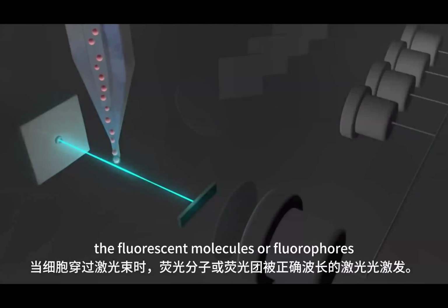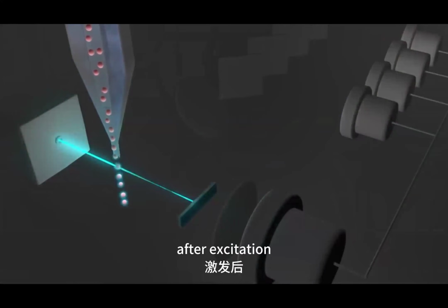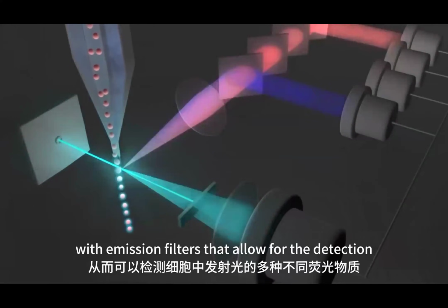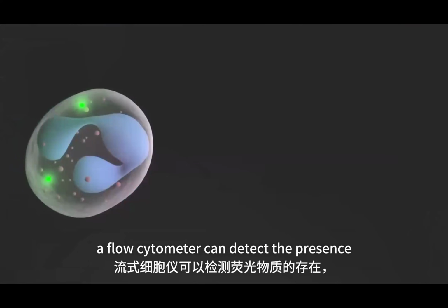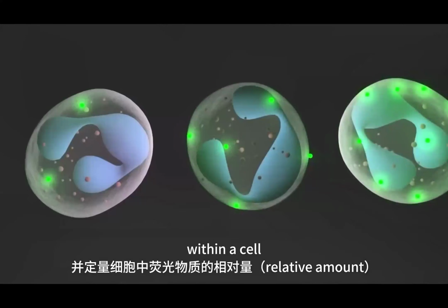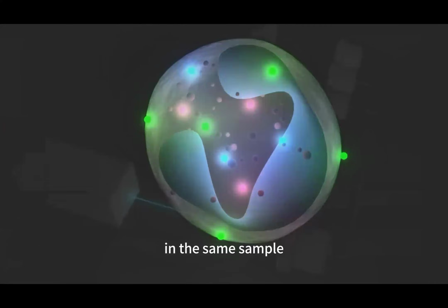The fluorescent molecules, or fluorophores, are excited by the correct wavelength of laser light when the cell passes through the laser beam. After excitation, the light emitted by the fluorophore is directed along a path with emission filters that allow for the detection of multiple different fluorophores emitting light in a cell. A flow cytometer can detect the presence of a fluorophore and also quantify the relative amount of a fluorophore within a cell. A flow cytometer can also be used to detect light emitted from multiple fluorophores in the same sample.